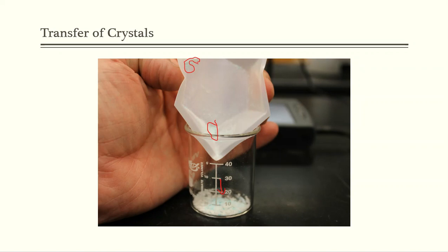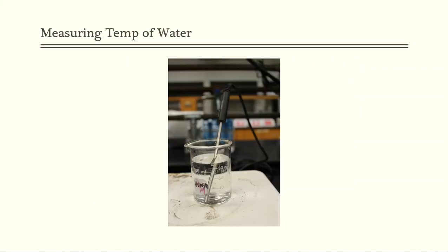That is my product that maybe I worked really, really hard for, and I want to make sure that all of this has been transferred over into that beaker, and I'll show you how I do that a little bit later, but never forget that, all right? So if you're in the laboratory and you're doing it on your own, always go back and do successful transfers in a laboratory environment.